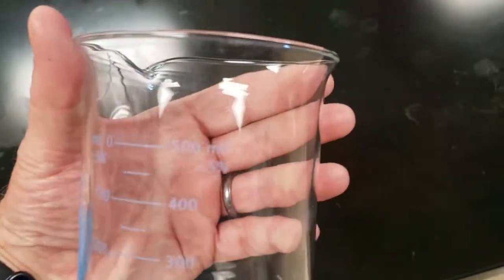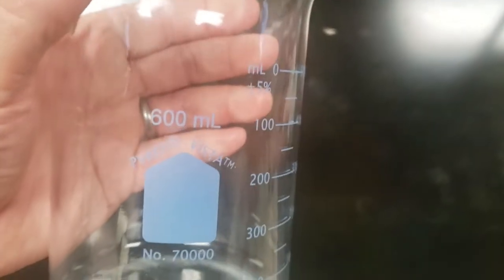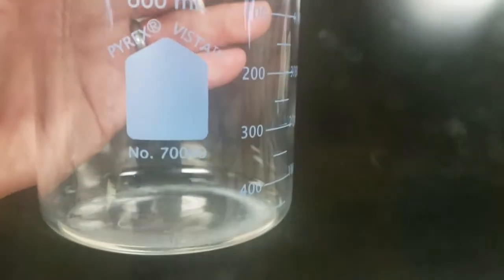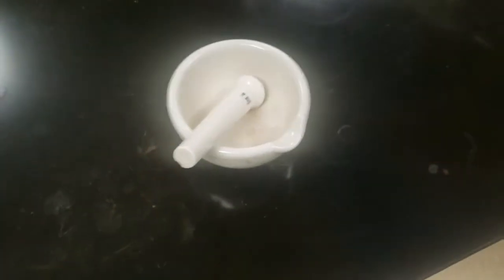This one says 500 milliliters, so you probably think it's a 500 milliliter beaker, but it's not. It's actually a 600 milliliter beaker. It just goes up to 500 and there's room at the top. It is also good to 5%. 5% of 600 is going to be 30, so it's only good to 30 milliliters, higher or lower than you're measuring. Beakers are not good for making precise solutions.